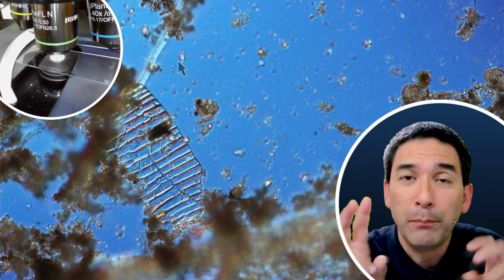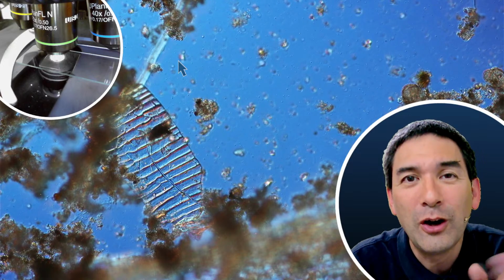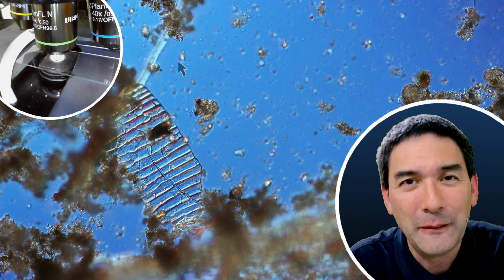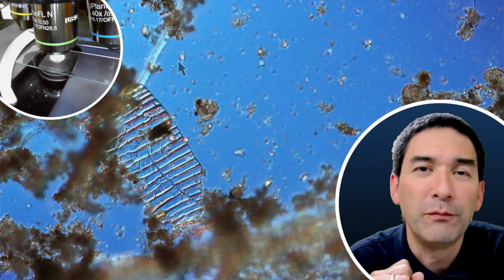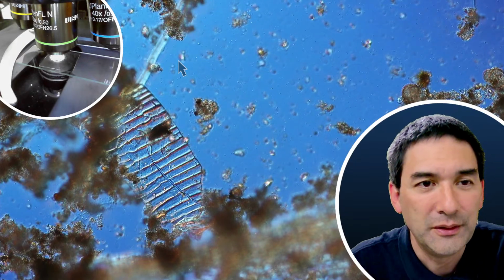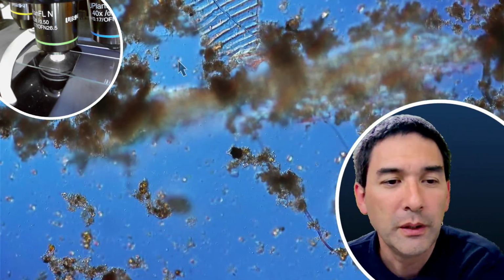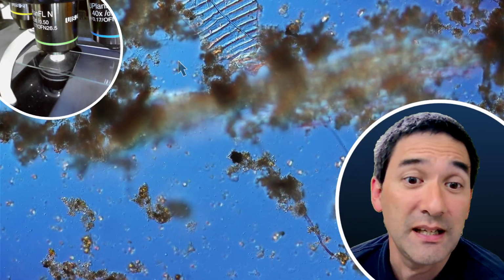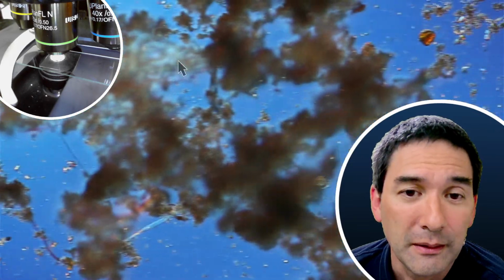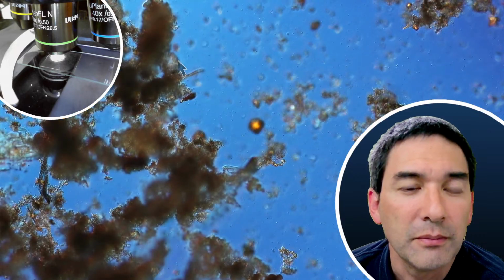So I think the limiting factor is not necessarily only how long you look and how patient you are, but maybe the actual moss sample itself. So I would simply collect different types of moss samples and then try it out. We can go on like this forever. Again, as I said, it's probably not one of the most exciting specimens, but you get the idea.